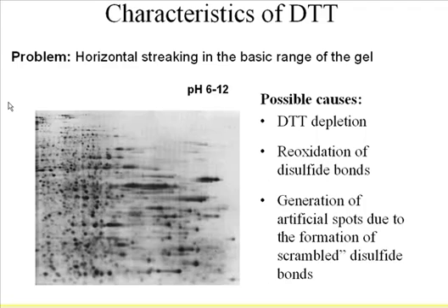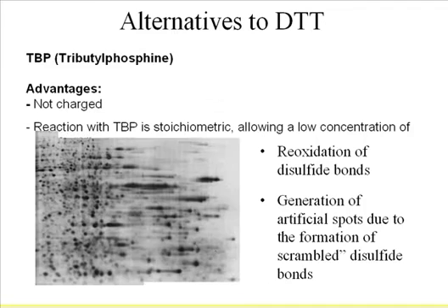So how do you solve the problem? Previously, people used a piece of filter paper called wicks at the basic end, and put a drop of DTT on the wicks. These wicks serve as a DTT reservoir, continuously feeding DTT into the IPG strip. It's not ideal, but it works. However, you need to stop your run and keep changing the wicks.